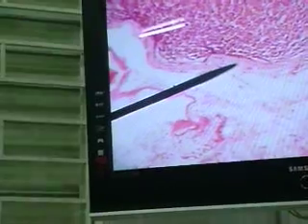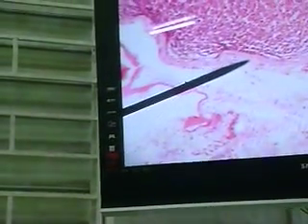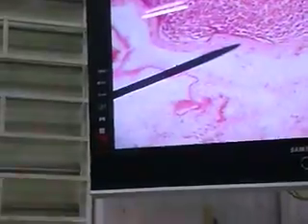In the palatine tonsil, not seen very well on this slide here, you can see to some degree what is referred to as a hemicapsule, not a full capsule. And it is said that this hemicapsule really is your pharyngobasilar fascia. Unlike a lymph node, which is completely encapsulated, the palatine tonsil only has a partial capsule. And these are the lymph nodules that we see here.